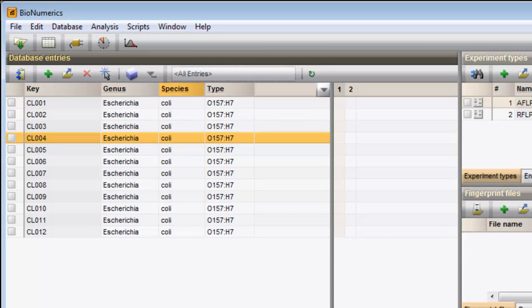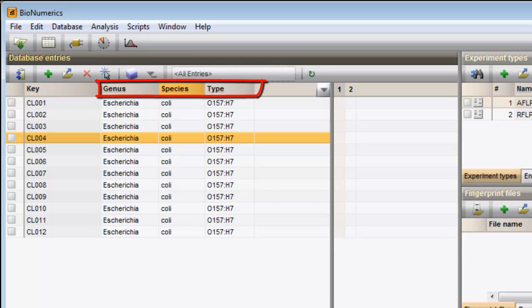Each column in the Database Entries panel corresponds to an Entry information field. The key field is a default information field. Three additional information fields have already been added to this database.